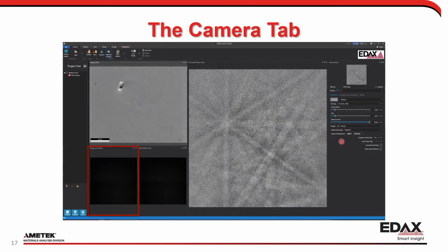Now, when you do these camera optimization routines, it zooms out by a factor of 4. The way around that is just click on SEM area right here, and that would allow you to use what your current field of view is as your background. So again, if you do use some of these smart optimization routines, you can go ahead and use the SEM instead. So there's that.